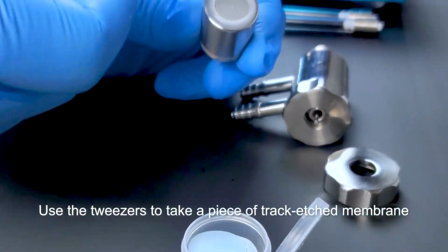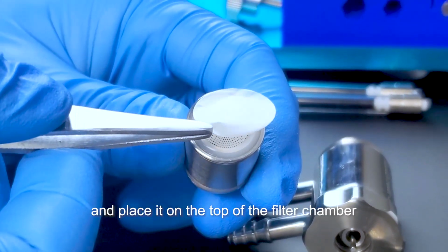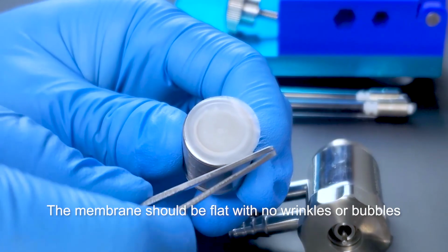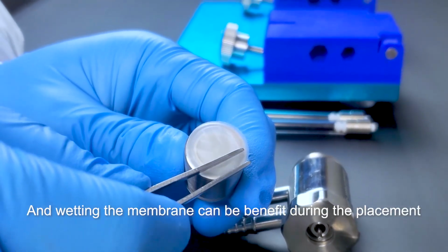Use the tweezers to take a piece of track-etched membrane and place it on the top of the filter chamber. The membrane should be flat, with no wrinkles or bubbles, and wetting the membrane can be a benefit during the placement.